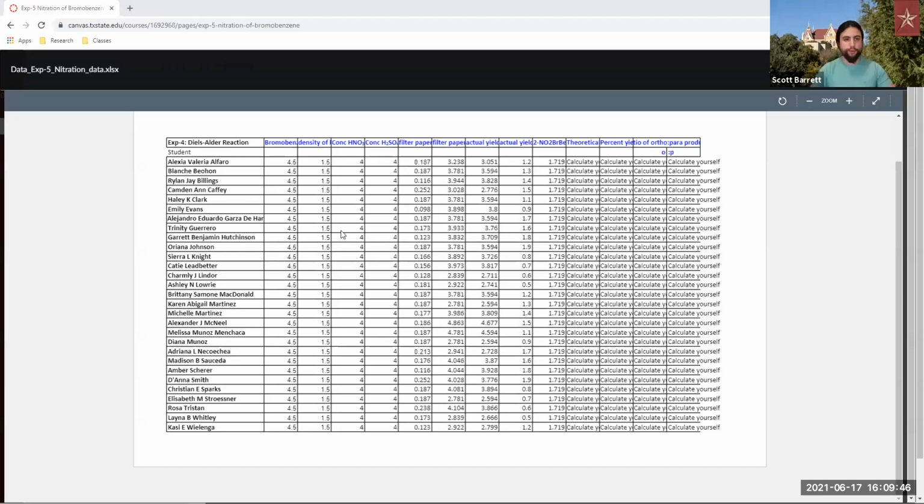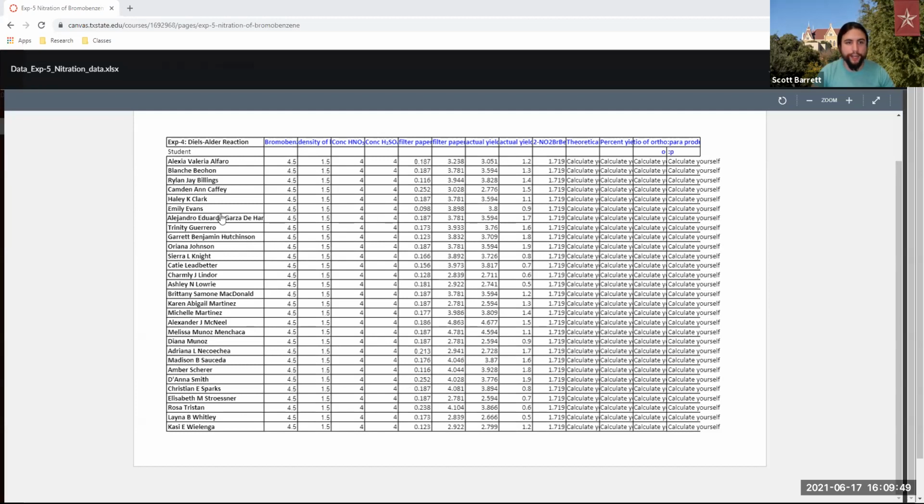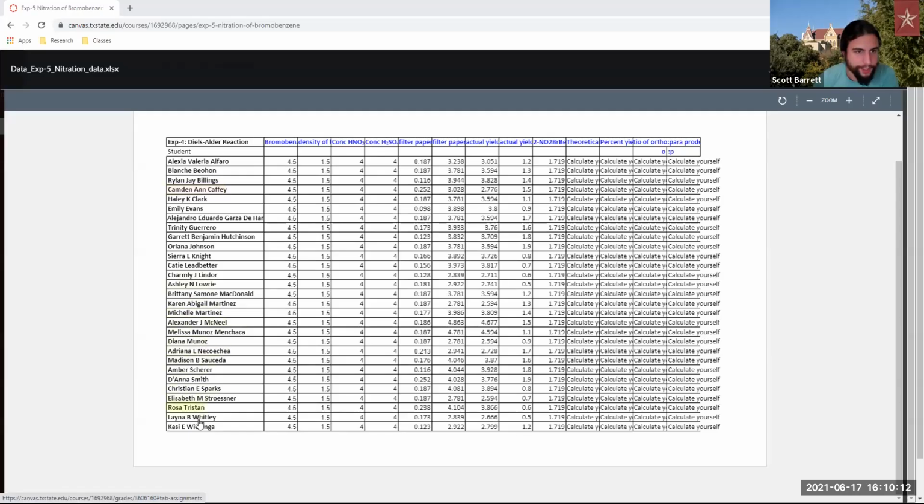For the data, let me open up here. Make sure to look through here and let me know if your data is not here. I have opened the separate one. One moment. Let me pause the share really quick. So we had Hannah, James, and Lucy, and yours was not on there last time. Let me check here. So Hannah, James, Lucy, I'm not seeing any of y'all. So I'm going to add in the data.